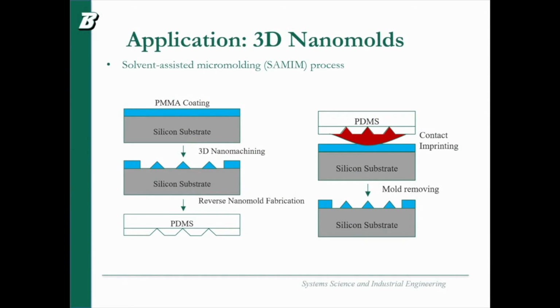We can do UV curing, just pouring on the molds, and get a replica similar to the original directly out of the AFM. But we also tried another thing that is usually tried in 2D. I don't see much of this process tried in 3D, so we are pretty interested in it.